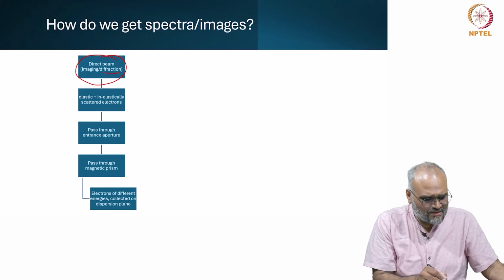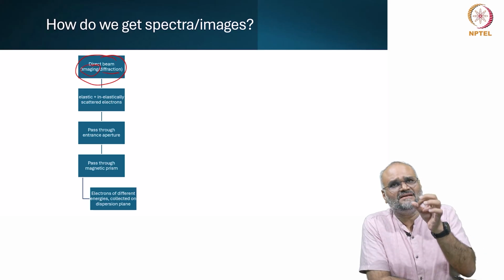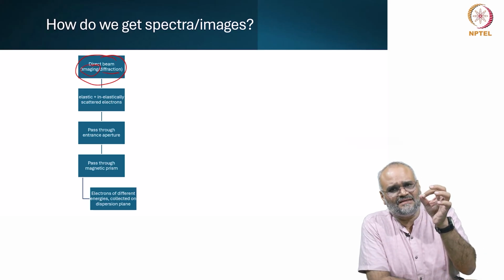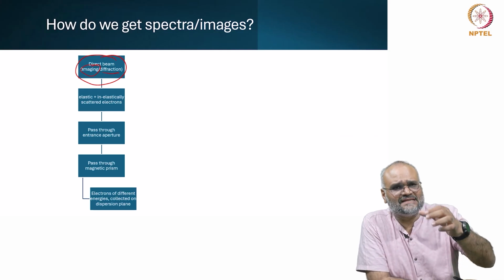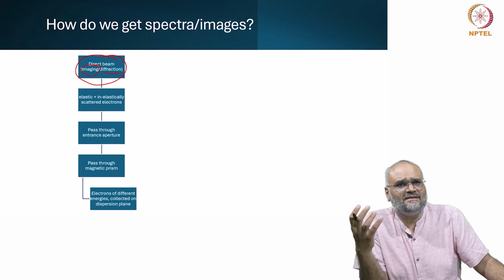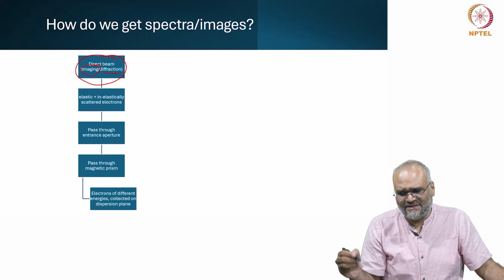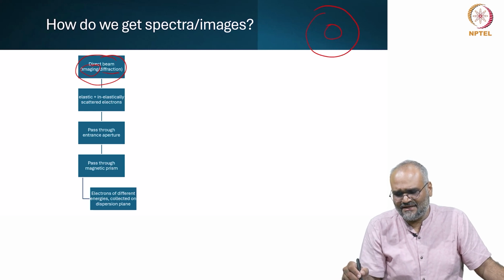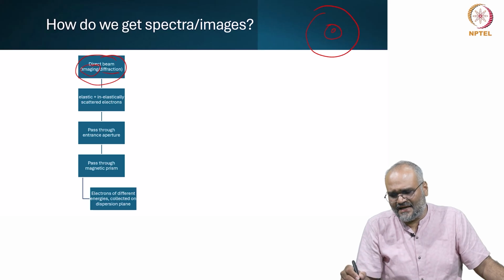I go to a specific region and I place my specimen of interest, or my field of view of interest, aligned with the entrance aperture of the post-column imaging filter. Typically, depending on whichever system you are looking at, you have on the fluorescent screen camera some kind of a signal like this.